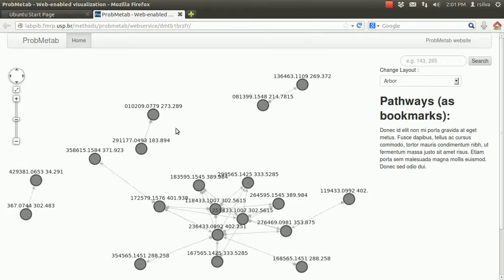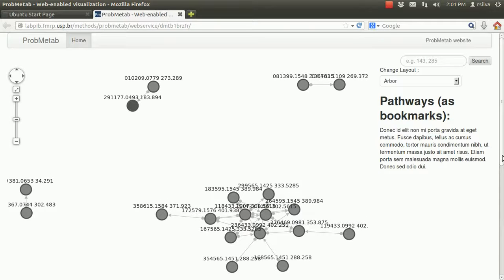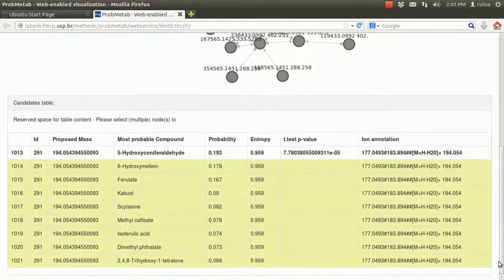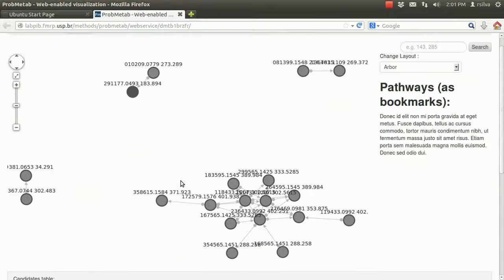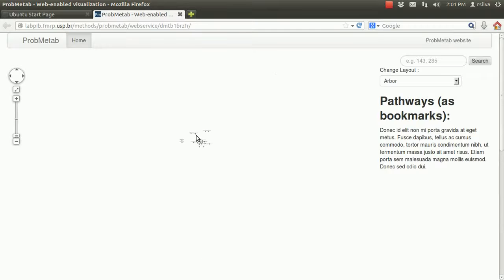The dynamic visualization with our web server allows the inspection of the overlapped network of reactions and connections without installing and opening other software. The supporting information helps the user to identify interesting relations associated with significant intensity mean changes.